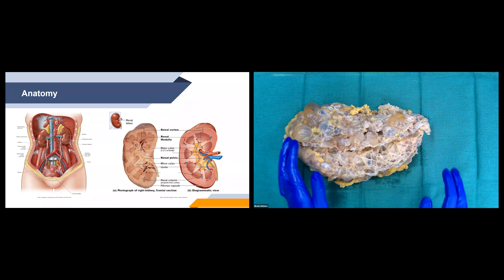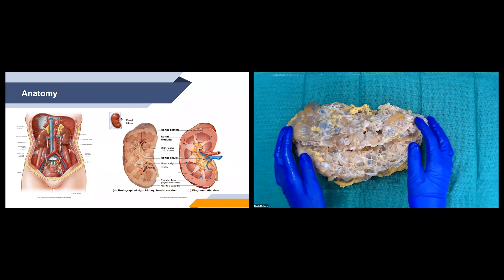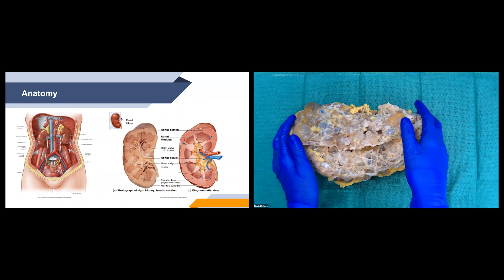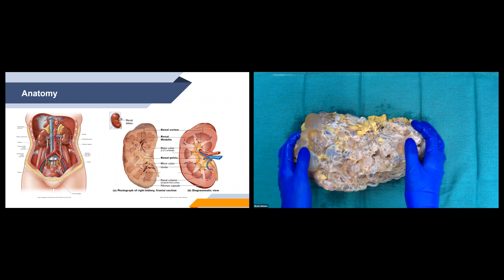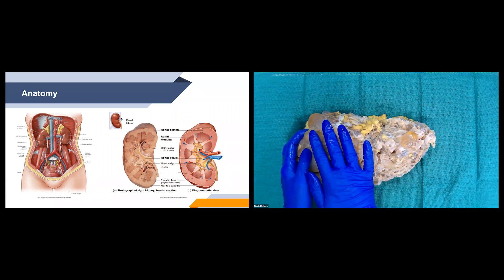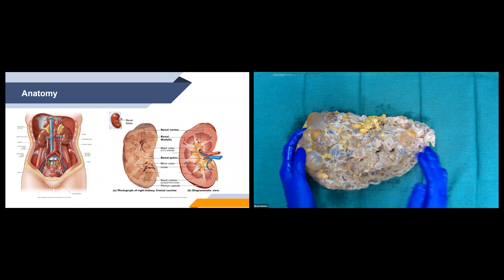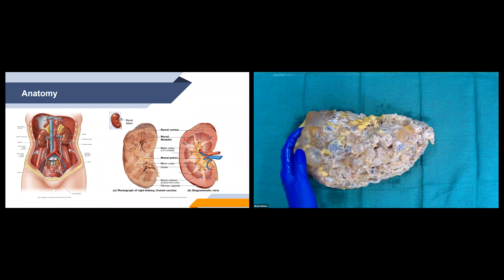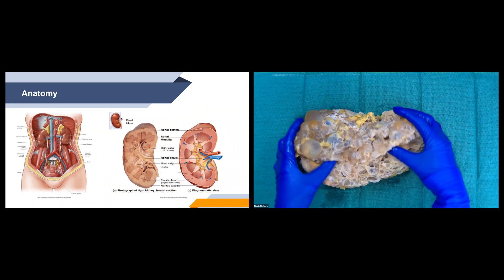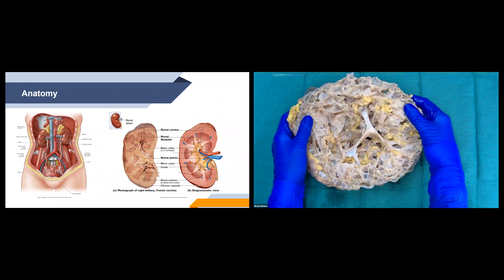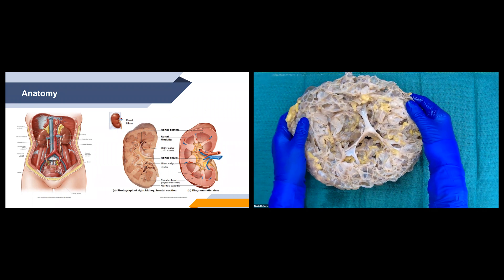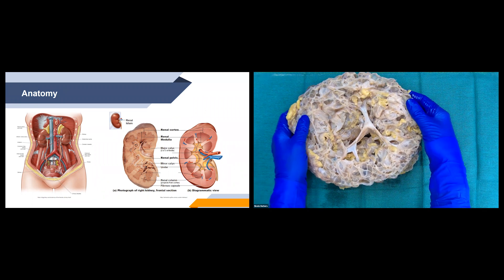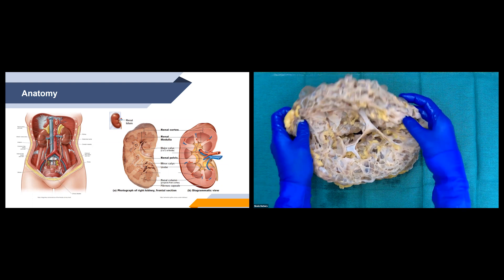Talking about the parenchyma of the kidney — going outside in, it starts with the capsule, which is the outermost aspect, then the renal cortex, and then the renal medulla, which is the innermost layer. We don't really see that clearly on our kidney here because there's some sort of pathology occurring.